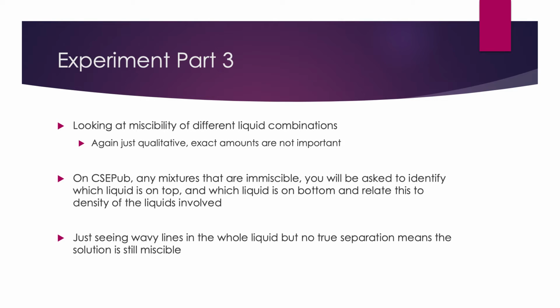We do still consider that a solution. We consider those liquids miscible, but there are still some weird things that come out of the actual mixing of those liquids. It's not just going to look like clear water would, so it might have a slightly different look to it. That's okay, and that's just something else to keep in mind as you're looking at these.